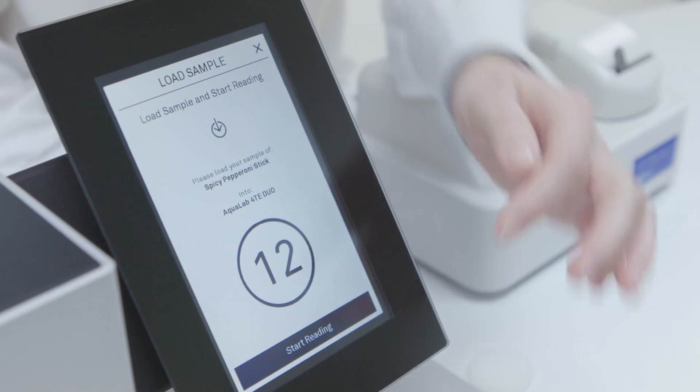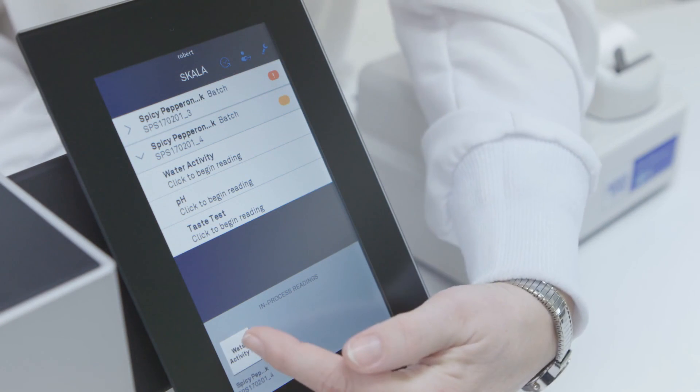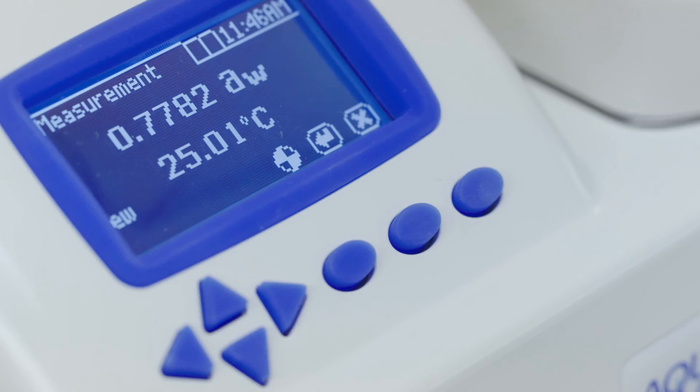In one or two minutes a preliminary number will show. The spinning wheel at the bottom of the screen indicates the Aqualab is still checking to see if the sample has stabilized. If you are recording readings manually, you can listen for the beep that shows that the instrument is done.